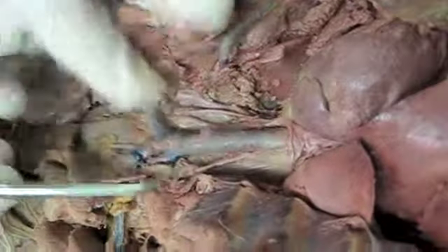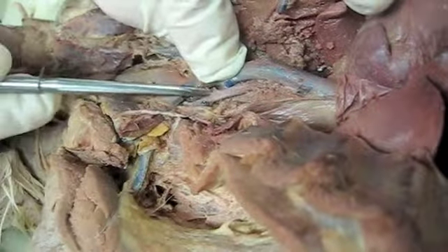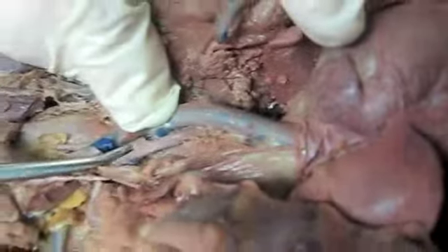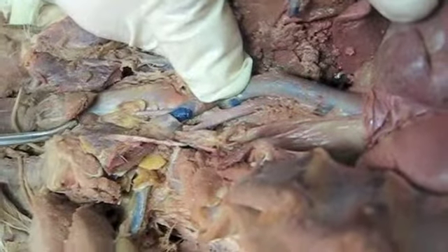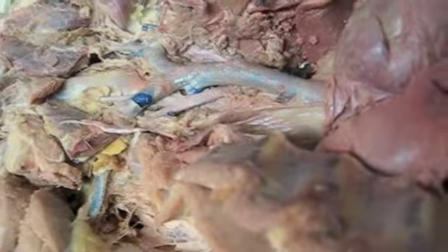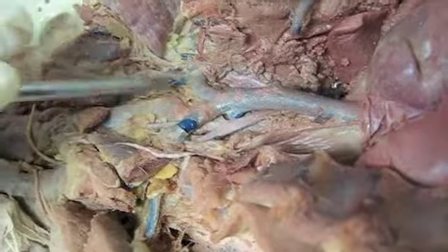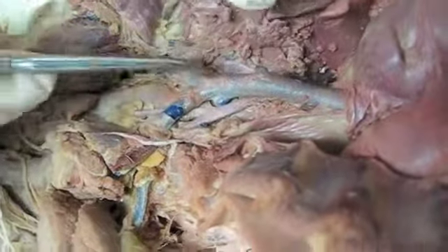So anyway, there's that big one, and if I lift it up here and go all the way up here, then it finally does branch. This one would be the right subclavian that would be going out to the right arm, and the other one here would be the right common carotid that's going up the right side of the neck. So hers just branches a little bit later. Usually all three of those, right subclavian, right common carotid, and left common carotid, all branch at about the same time, but it doesn't. So that's the brachiocephalic.